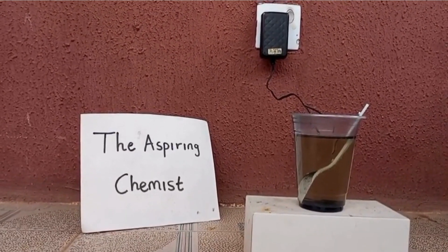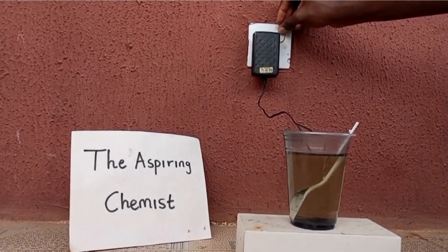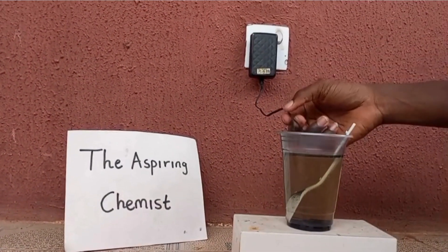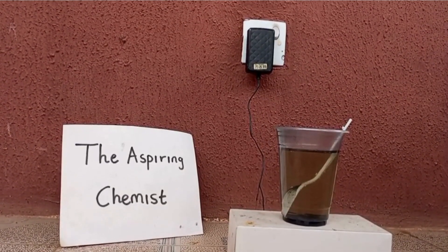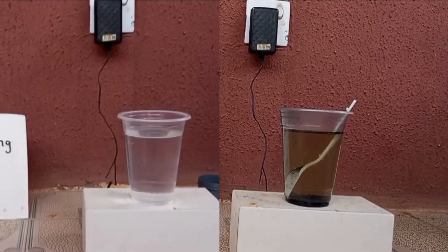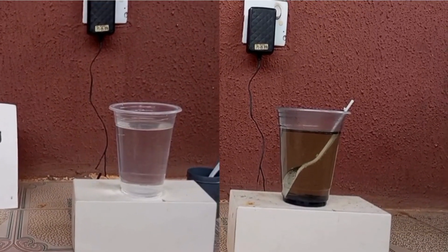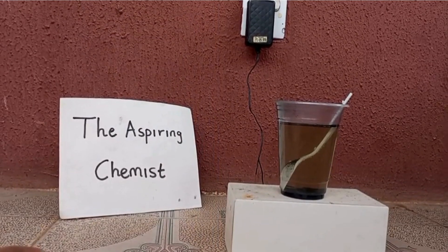A few days have passed and I'm satisfied with the solution we have here, so I'm going to disassemble the setup. If you look at the solution you'll see that it has acquired a yellow color, in contrast to what it was the first day we started. Now that I've stopped the electrolysis, let's move inside for the filtration.